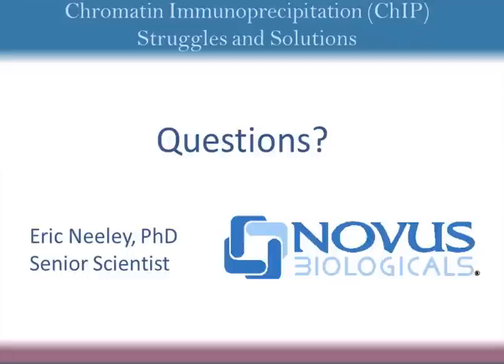So the precipitator helps a lot in cutting down on the time by having that automated phase, especially if you're multiplexing and doing more than one sample at once, because with the precipitator, like I said, you can use 16 different samples, so you are moving the beads from one well to the next within 15 seconds for 16 samples, whereas otherwise, even using the magnetic bead technology, which will make things go a lot faster regardless, you're still having to transfer those beads into different wash buffers, one at a time for each of those 16 different samples.